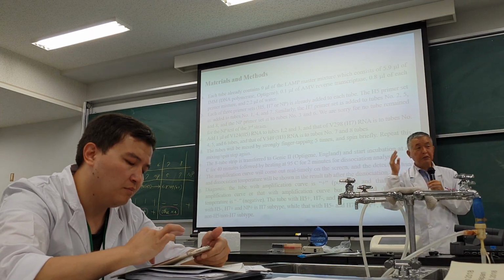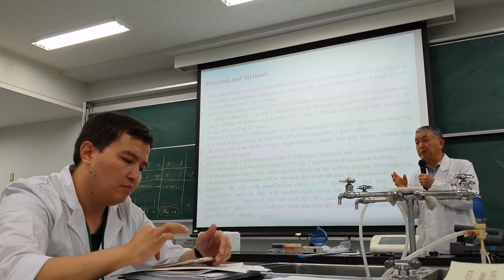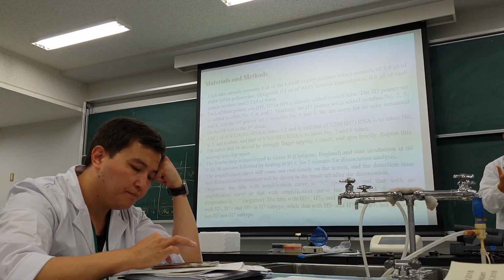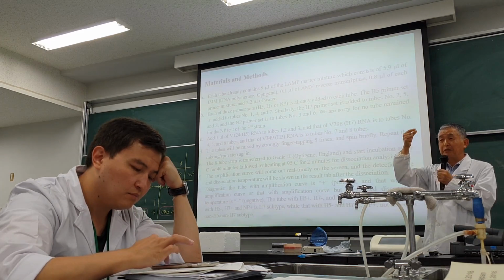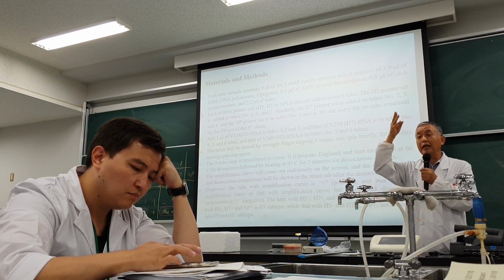Why don't you use pipetting? Pipetting sometimes induces contamination problems very frequently. At first we didn't know the source of the contamination. Finally, we found the pipette itself; the inside of the pipette can be covered with the product.